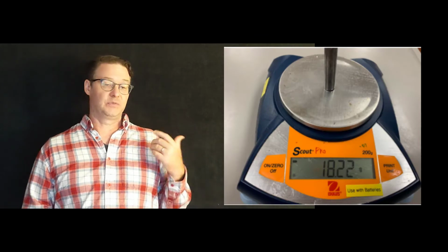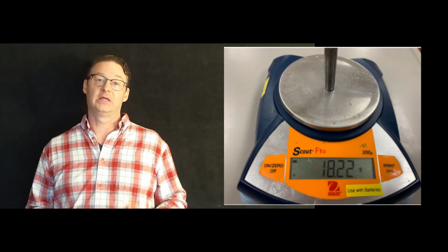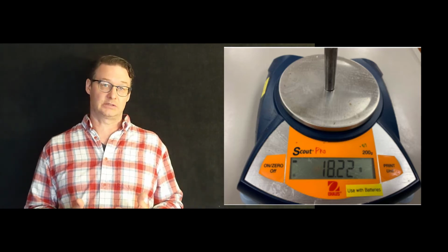Now that we've measured the volume of the cylinder, we need to take its mass. And to do that, we're going to use an electronic balance, which we commonly refer to as a scale. And on this one, the estimated digit is just the last digit on the display, which you can see here. This is the mass of this cylinder. So we have the volume, which we calculated a minute ago. Now we have its mass, and mass divided by volume equals density. So that's going to be one of our calculations.